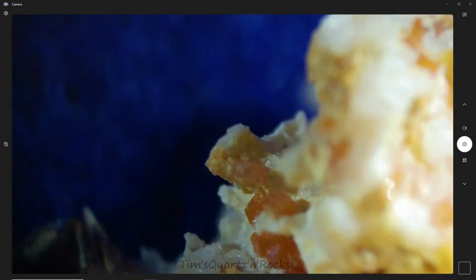So that's the Pb. The chemical formula is Pb5(VO4)3Cl. That is a mouthful. I'm probably not saying it correctly. But the Pb is lead, and then we've got oxygen, of course. Chloride?